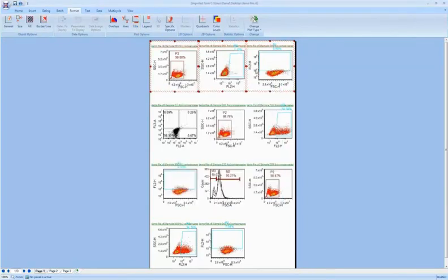Everything that you see about this plot is customizable. And like I've said before, you can find out the details of that in other webinars and in many other resources on our website.